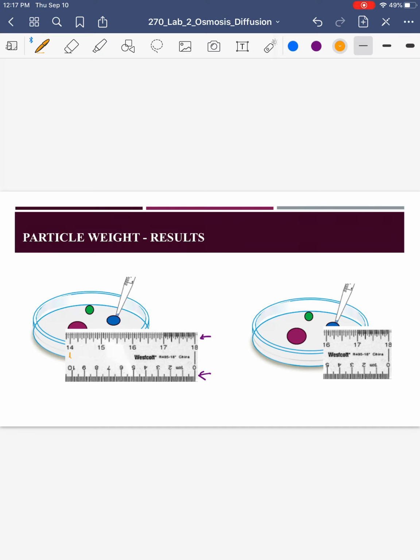From here to here is 1 inch. Right? And this would be 14.5. So you're just going to have to count, right? So you want to count from this side to this side and count how many inches or how many parts of an inch it would be, okay? Each one of these lines, by the way, is 0.05. All right, you are smart enough to figure that out.